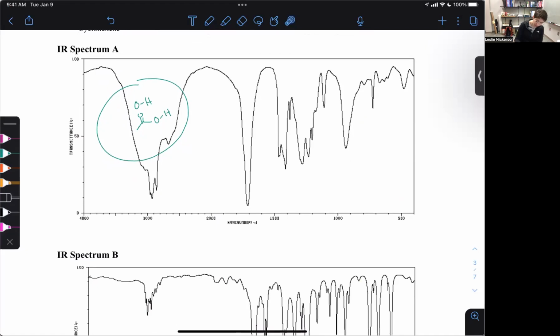So then we can see we have kind of that peak, but then we've got this one poking out the bottom. Okay, that is a clear sign of a peak overlapping where we've got this kind of thing and then it juts down and is jagged. So this one, if we look at where our 3000 peak is, there we go, perfect.